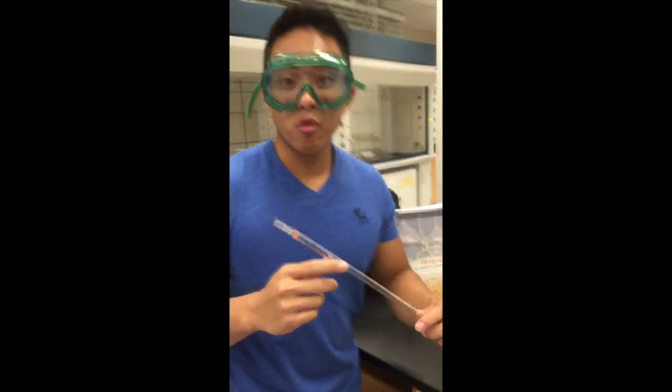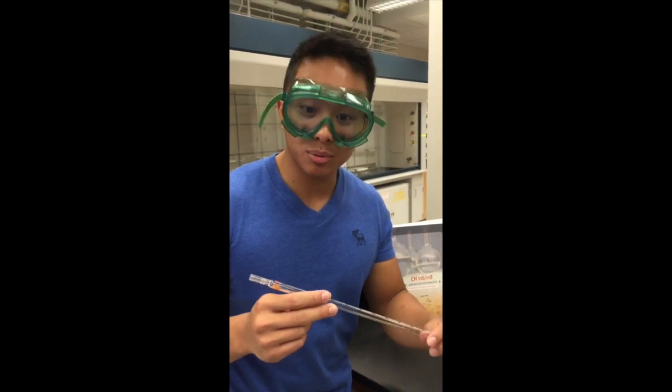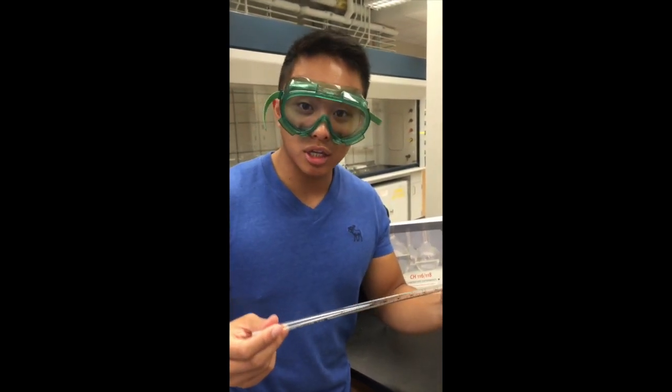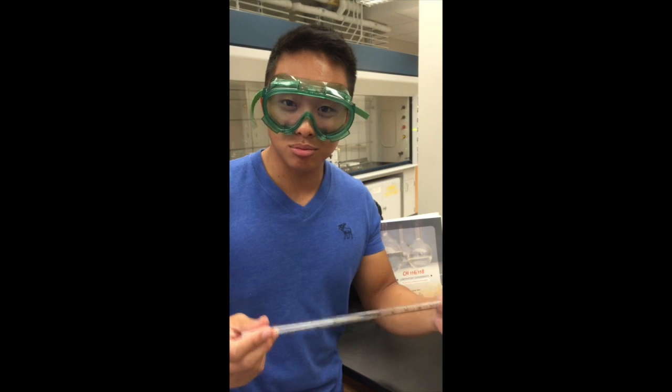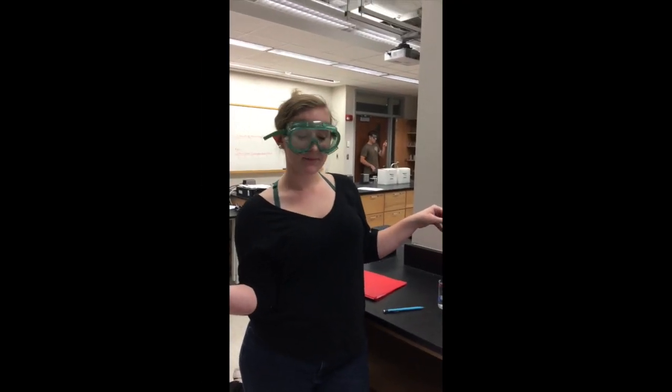But wait, before starting your laboratory experiment, you must prime your pipette. The way to prime it is you rinse it with water 3 times and then with a solution 3 times. Okay, so now that you know what your pipette is, we're going to learn how to use it.